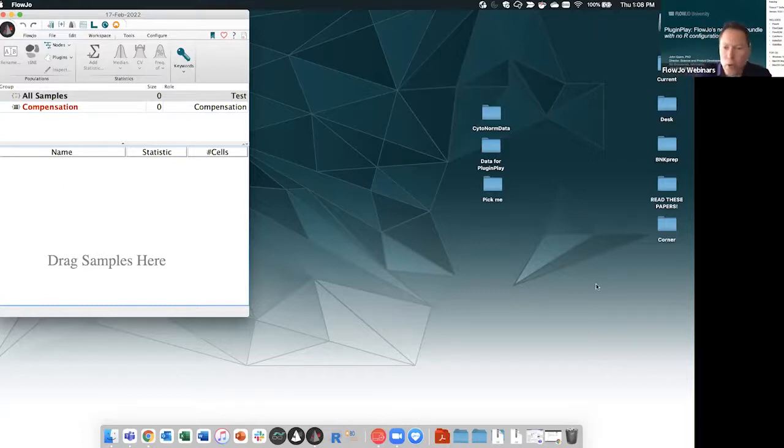It looks like we've got another question in the Q&A. Can you put these plugins in the standard folder with the other plugins? Yes, you can, Lauren. Good question. I will even suggest that there are a handful of plugins that are going to be super complementary to the ones that are right here. It's worth downloading them and dropping them into the same folder, and you're good to go. If you've got multiple versions of the same plugin, we will generally just use the first one in the list. And so if you've got a working version of the plugin already in there, you drop plug and play, I think you can use them both.